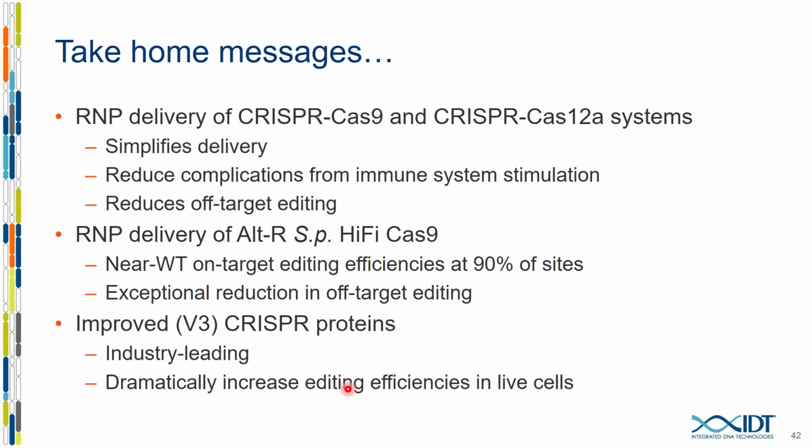Next, William would like to know how valuable are programs, including IDT's, that predict the guide RNA efficiency? I think they're extremely valuable. I just think it's such a difficult thing to do that, you know, I think eventually somebody's going to get it right and it's going to really improve things. But I just don't know how much work it's going to take to get there. I really think it's turned out to be something that's really challenging to do. So to answer your question, I think it's invaluable.